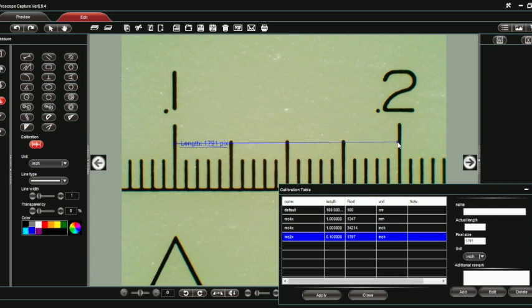In the computer program, this distance shows a pixel length of 1791 pixels. But I know the actual distance is .100, so a hundred thousandths. So I'm calibrating — I know that 1791 pixels is equal to a hundred thousandths of an inch, and that's what I'm going to enter.